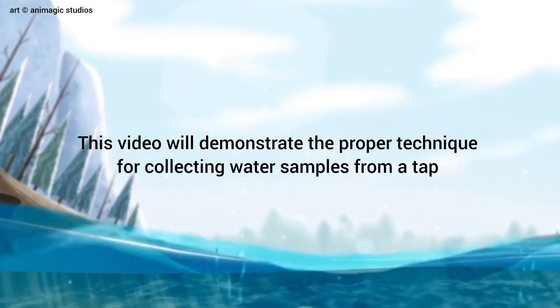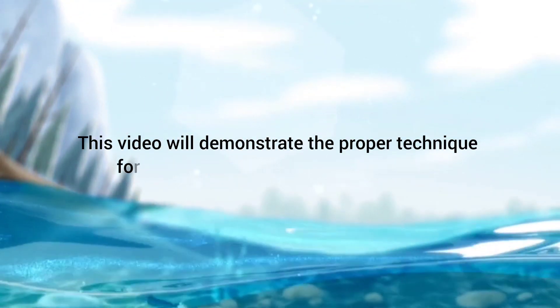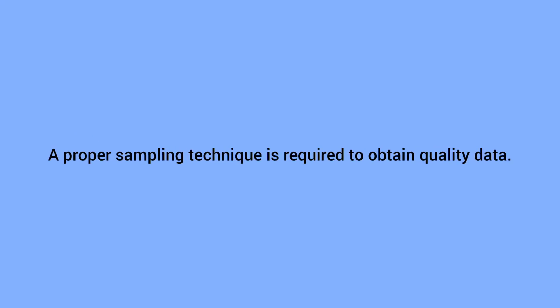This video will demonstrate the proper technique for collecting water samples from a tap. A proper sampling technique is required to obtain quality data.